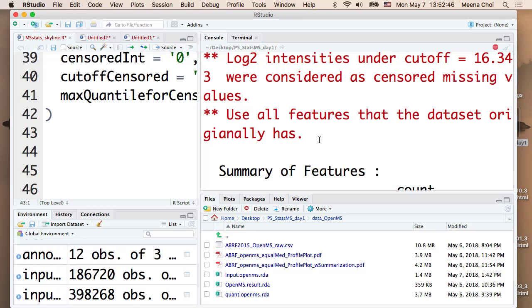You can use top 1 or top 3, top 5 features or top n features, especially for the DIA case, if you want to reduce the number of features. We are developing a feature selection method which can select the most informative features. Not published yet, so we hope that we can make this available very soon.